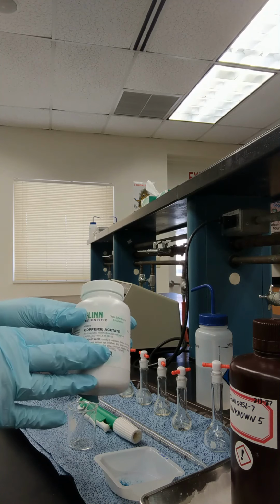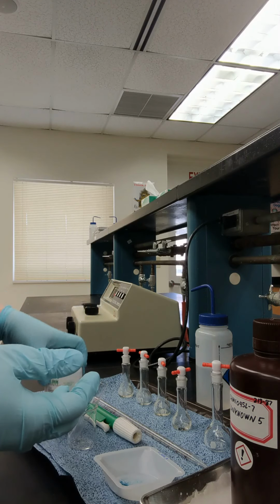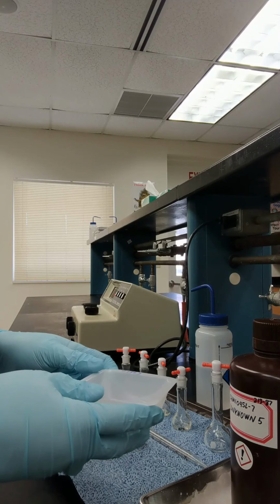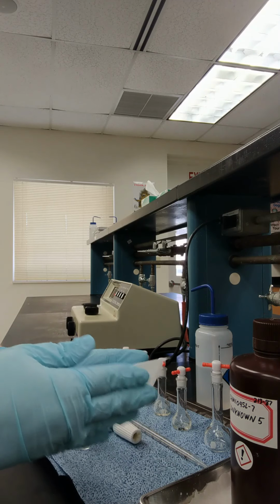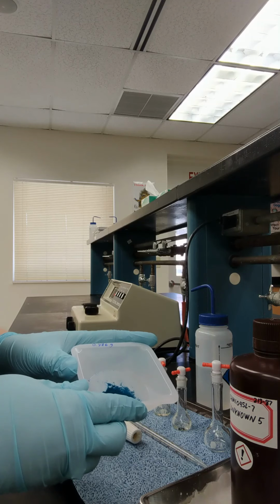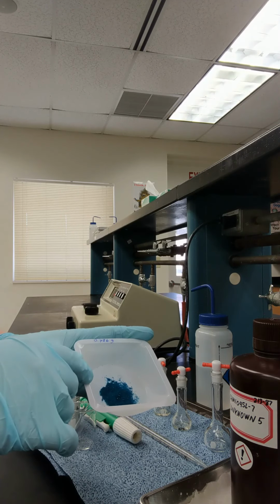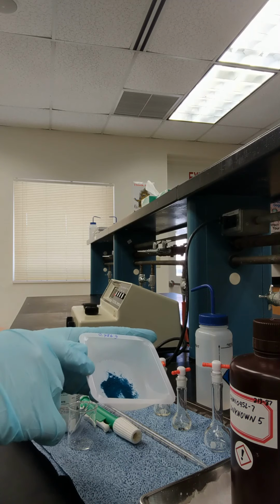Once we have that number, we can weigh an amount that is close to that number, not exactly the same, but something close to what we calculate. I already did that part here, and I have my copper acetate, the amount that I'm going to be using for that stock solution.